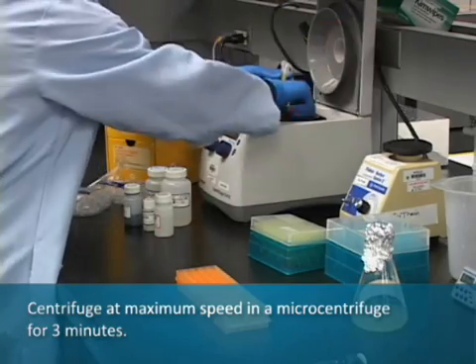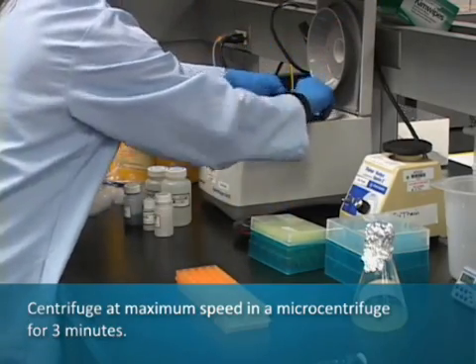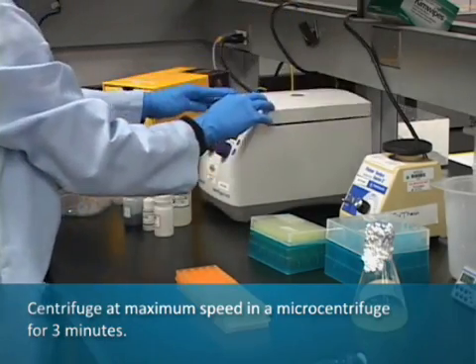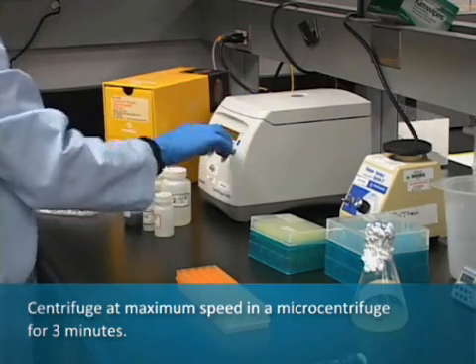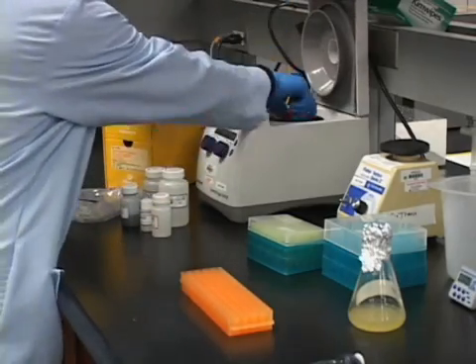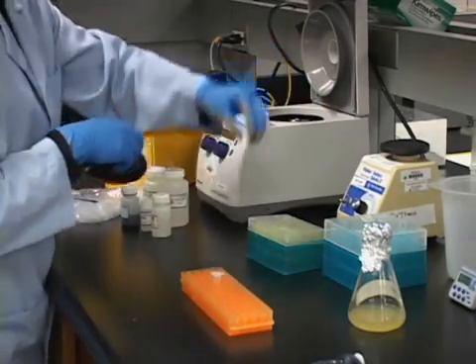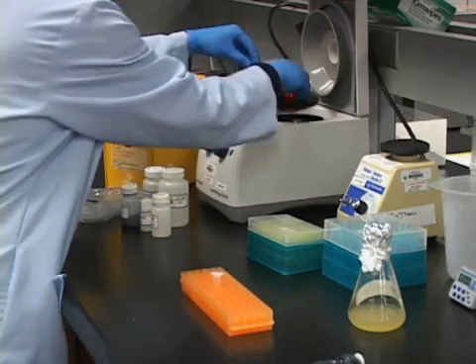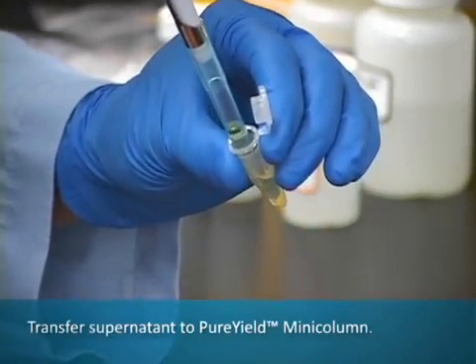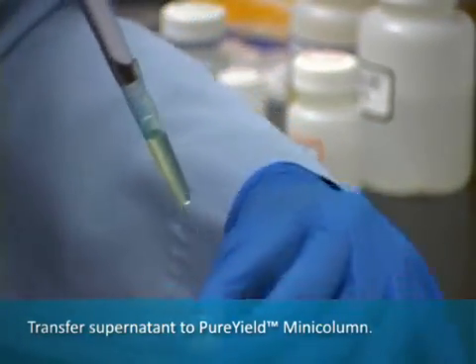Centrifuge at full speed in a microcentrifuge for 3 minutes. While the centrifuge is in operation, assemble the pure yield mini column. After centrifugation, transfer the supernatant to the pure yield mini column and centrifuge at maximum speed for 15 seconds.